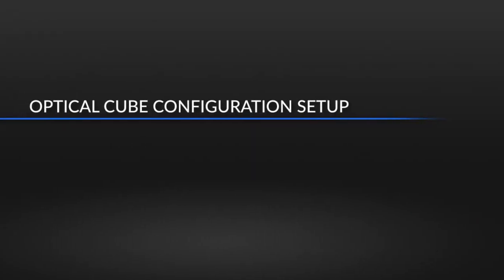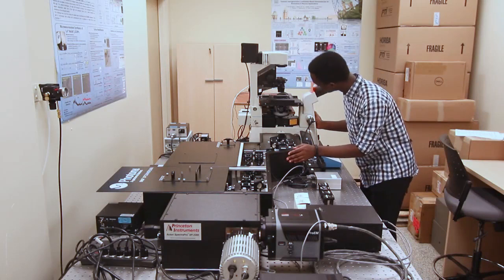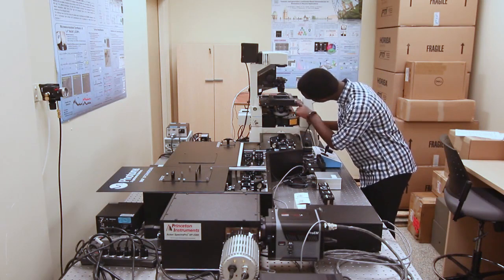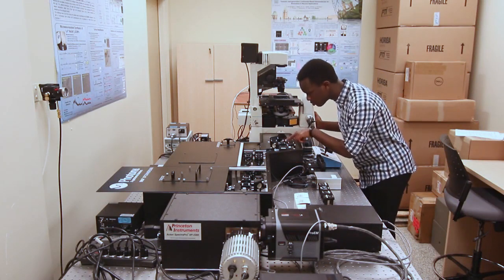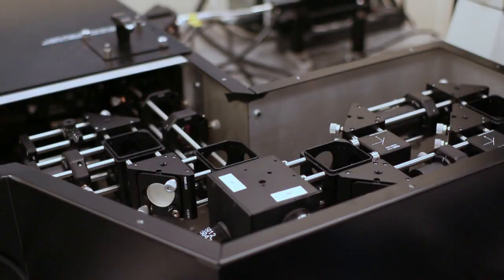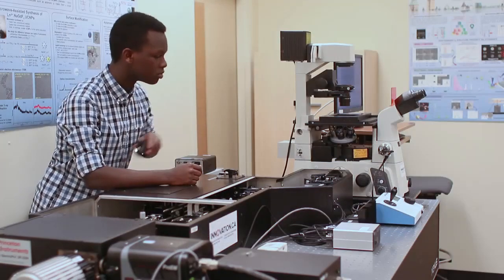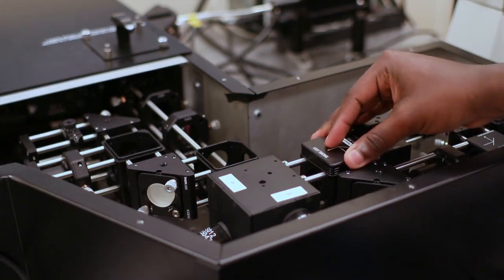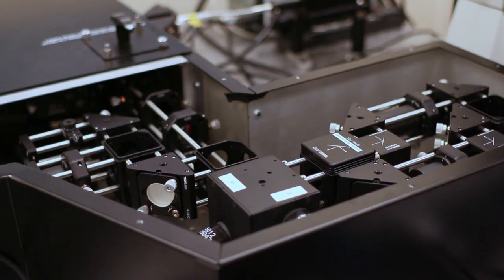To set up the imager configuration for hyperspectral imaging mapping, starting from the microscope stage and following the emission beam pathway toward the detectors, leave the position for an optical cube right next to the optical microscope vacant and place the confocal microscope optical cube in that position that directs the emission from the sample through the visible light path.